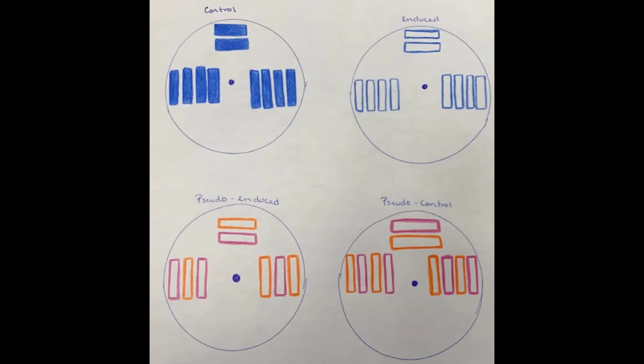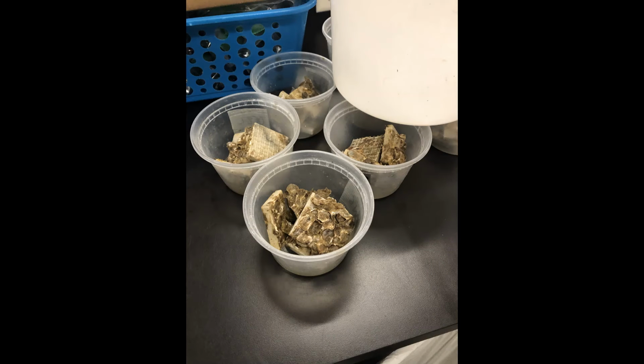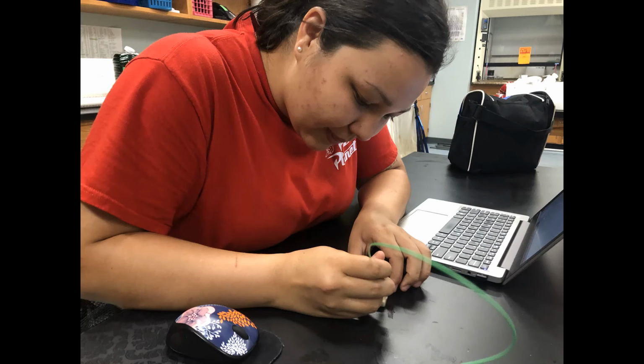The tanks were maintained in the same manner as they'd been prior, i.e., tanks housing predators were fed 1 crushed oyster per crab every Monday, Wednesday, and Friday, and each tank experienced the same morning and afternoon cleaning discussed previously. Once the oyster cages aged to the 4-week mark, the crushing process was repeated. This time, random sets of 5 tiles were removed from varying cages and measured in length and raw crushing force.